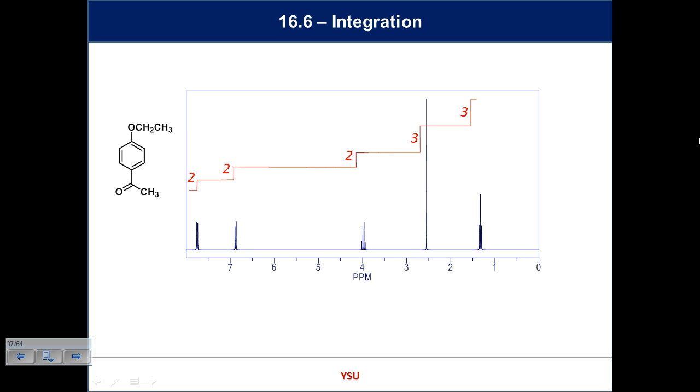Okay. Other examples here, more complicated signals. We can see a benzene system. Now I'm going to mention this now, and then we'll come back to it because we haven't done any benzene chemistry yet. Look how clean that pattern is. Those protons down there, one of the signals belongs to this set of protons, and the other signal belongs to this set of protons. Why is it so nice and tidy?